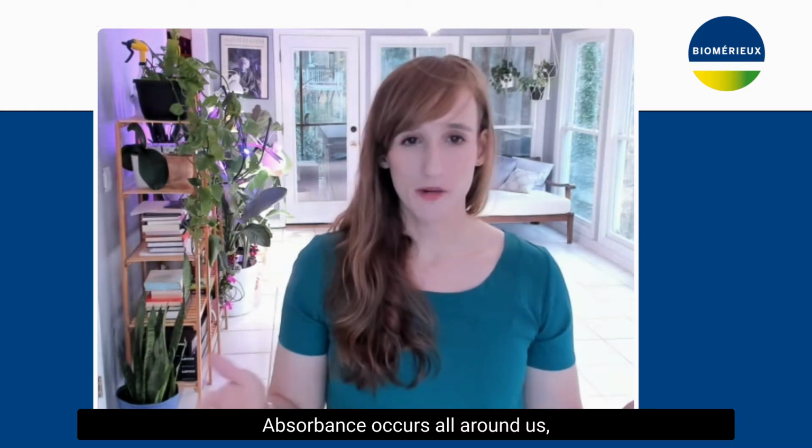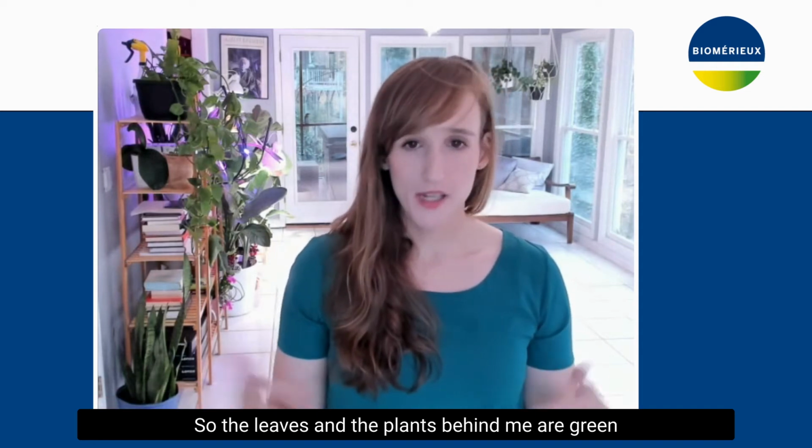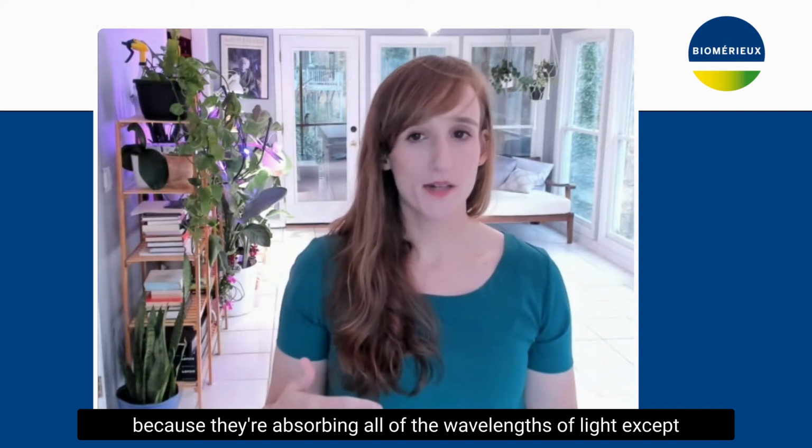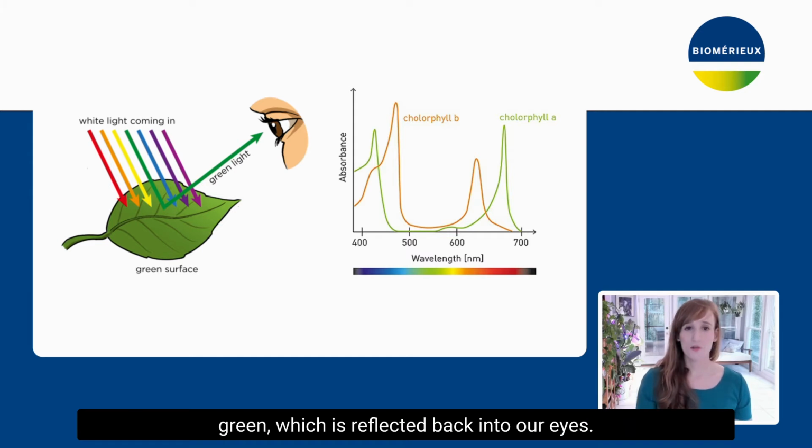Absorbance occurs all around us. Colors are due to absorbance, right? The leaves on the plants behind me are green because they're absorbing all of the wavelengths of light except green, which is reflected back into our eyes. Absorbance detection is a method used by scientists to quantify absorbing molecules in a solution. Absorbance can be used to do several things, but one of the more common uses is to determine the amount of a known substance in a solution.